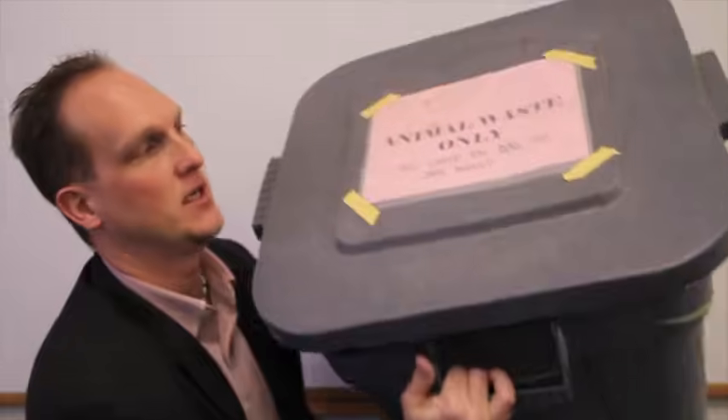Cleanup requires you to throw away your group's dissected heart into the big gray tub that says animal waste only. Please put it in the bag, not just in the tub. Wipe down your dissection area, washing and drying all tools, dissection tray and pad, and your hands before you leave.